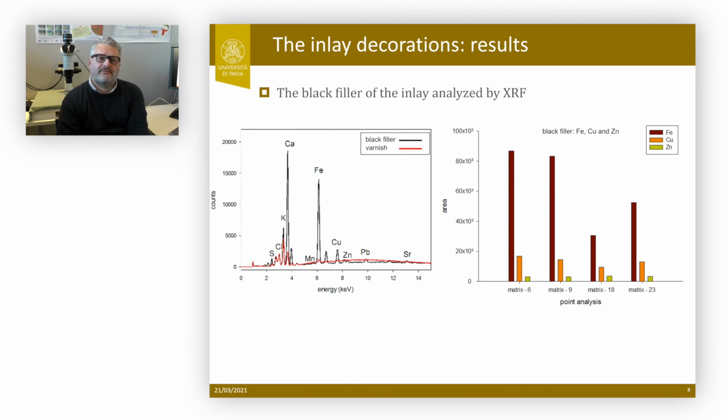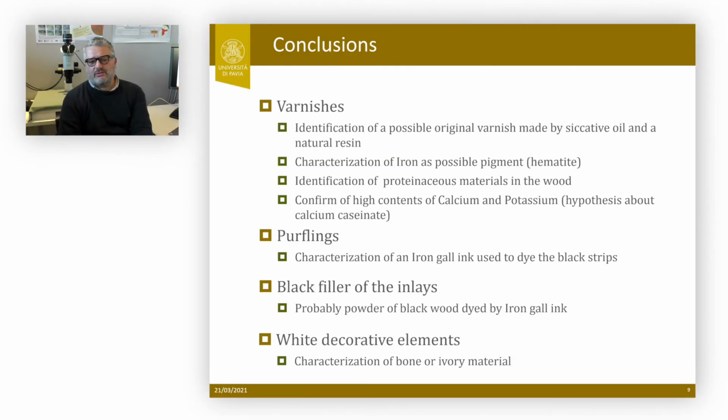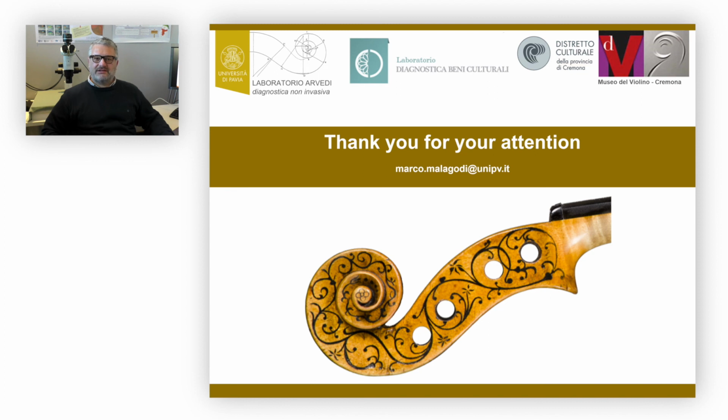we got from the purfling. So in this case, this violin was important to analyze by ELIO because we got important results on the pigments used to dye the varnish, for instance iron, and even regarding other materials probably used to treat the wood before varnish, like calcium and potassium, and even the presence of lead as a siccative for the oil varnishes. At the same time, it was important because we got results regarding the inlays and purfling with high counts of iron, copper, and zinc. That led us to hypothesize the presence of iron gall ink used by Antonio Stradivari to dye this part of the instrument.